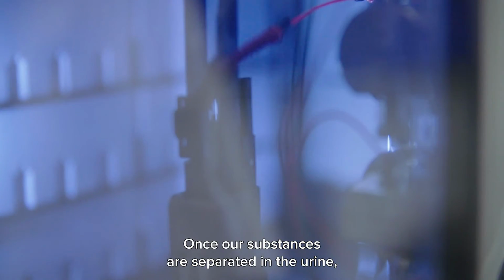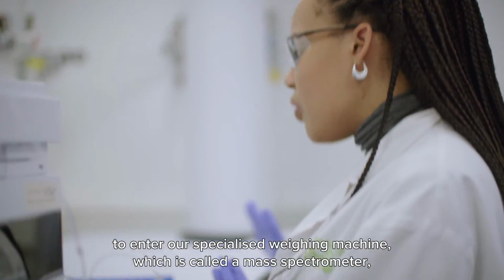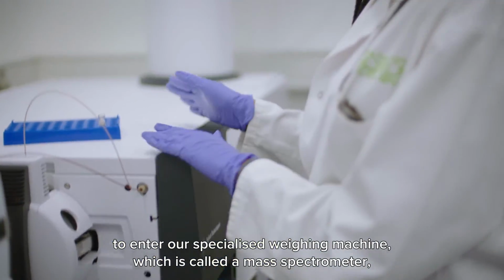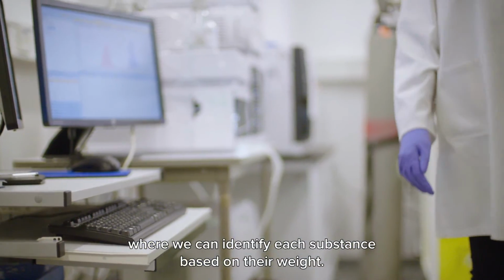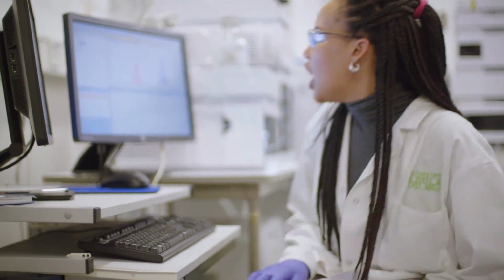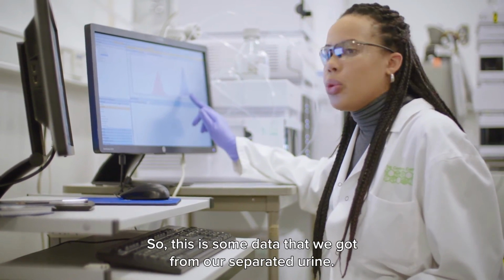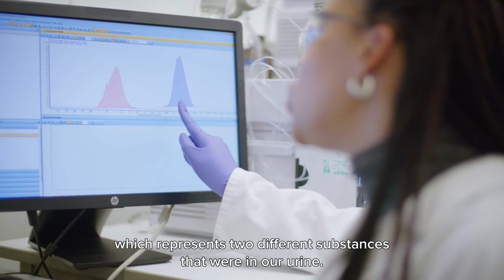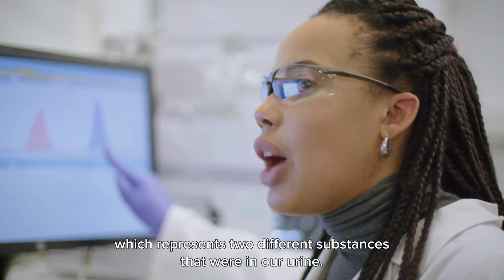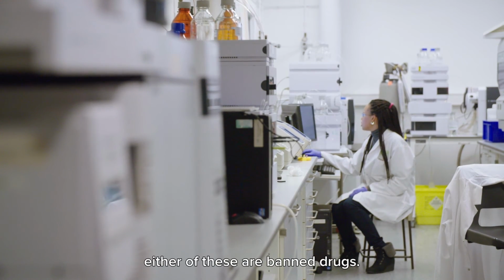Once our substances are separated in the urine, they then leave the column to enter our specialized weighing machine, which is called a mass spectrometer, where we can identify each substance based on their weight. So this is some data that we got from our separated urine. We have two different peaks here, which represent two different substances that were in our urine. From the graph, Danielle can tell whether either of these are banned drugs.